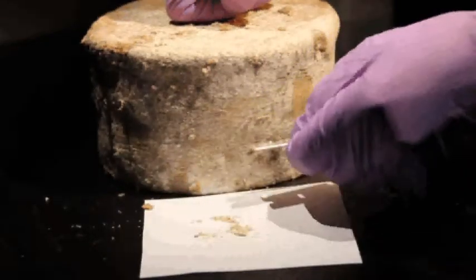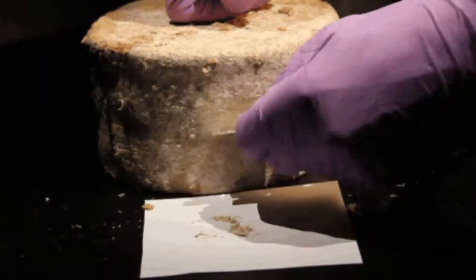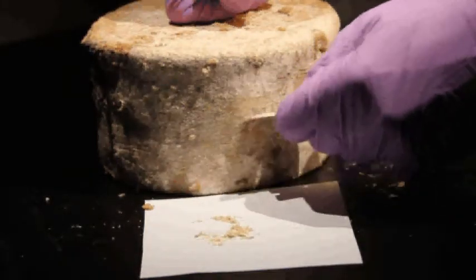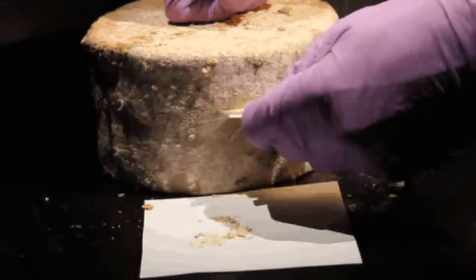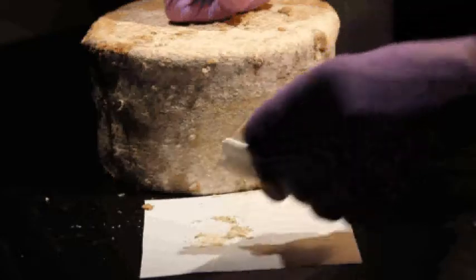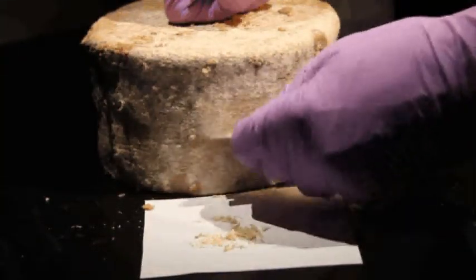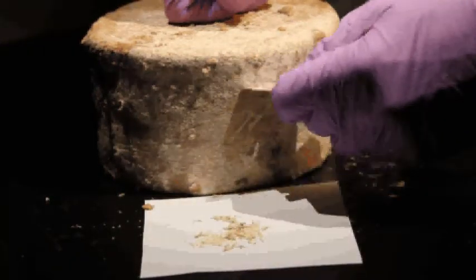For our study, we don't want the microbes from the curd — we only want the microbes in the rind. So it's important not to scrape too much. Depending on your cheese and how thick the rind is, you'll need to keep scraping until you start to see some of the curd coming through.